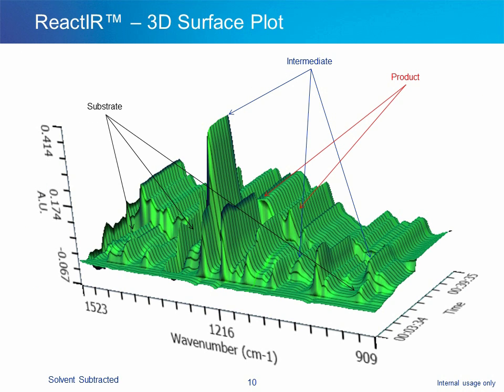As we have been collecting real-time in-situ mid-infrared data using the React-IR, we can now take a look at how the molecules are behaving. Here we see part of the mid-infrared spectrum, where spectra have been collected automatically as a function of time. We collected the solvent, toluene, as a reference spectrum and then used an automatic solvent subtraction algorithm to remove the spectral contribution of the solvent, which is why in the first three spectra you simply see a flat line. We can now see distinct absorbances for each of the reactive species: substrate, intermediate, and product.